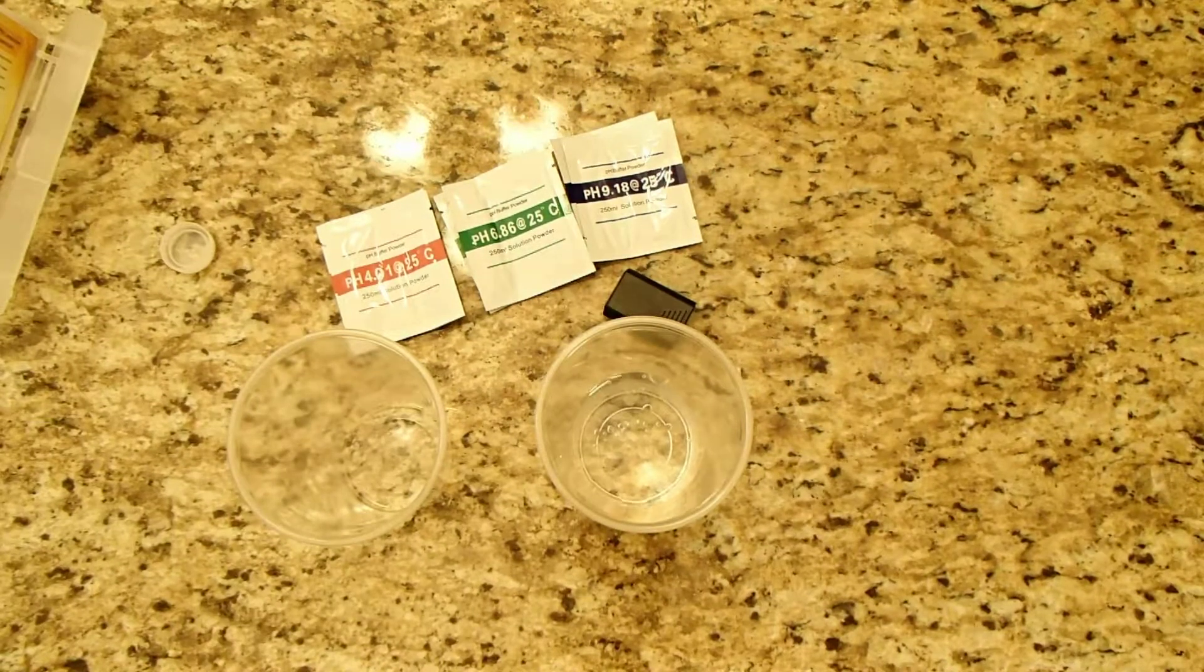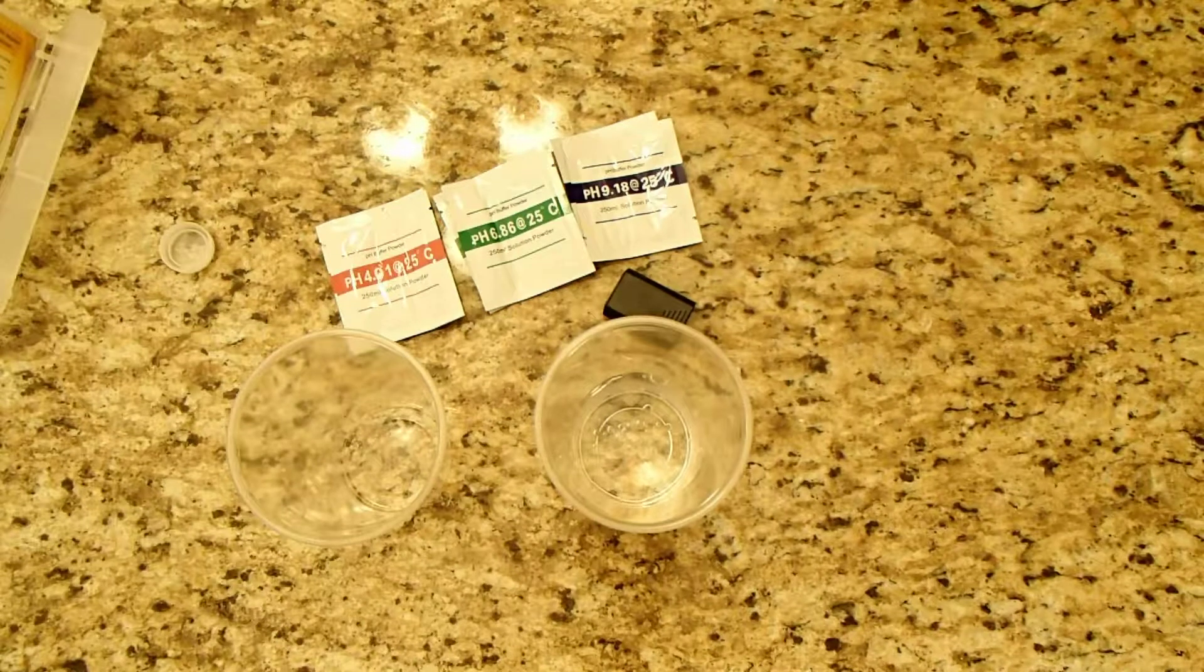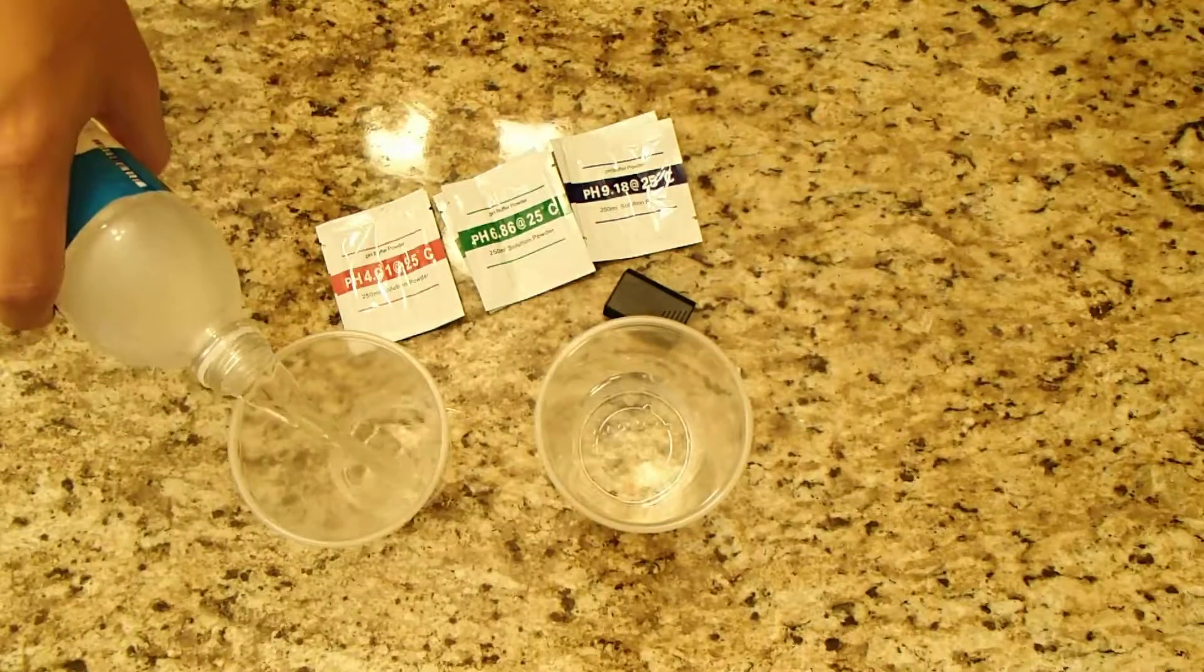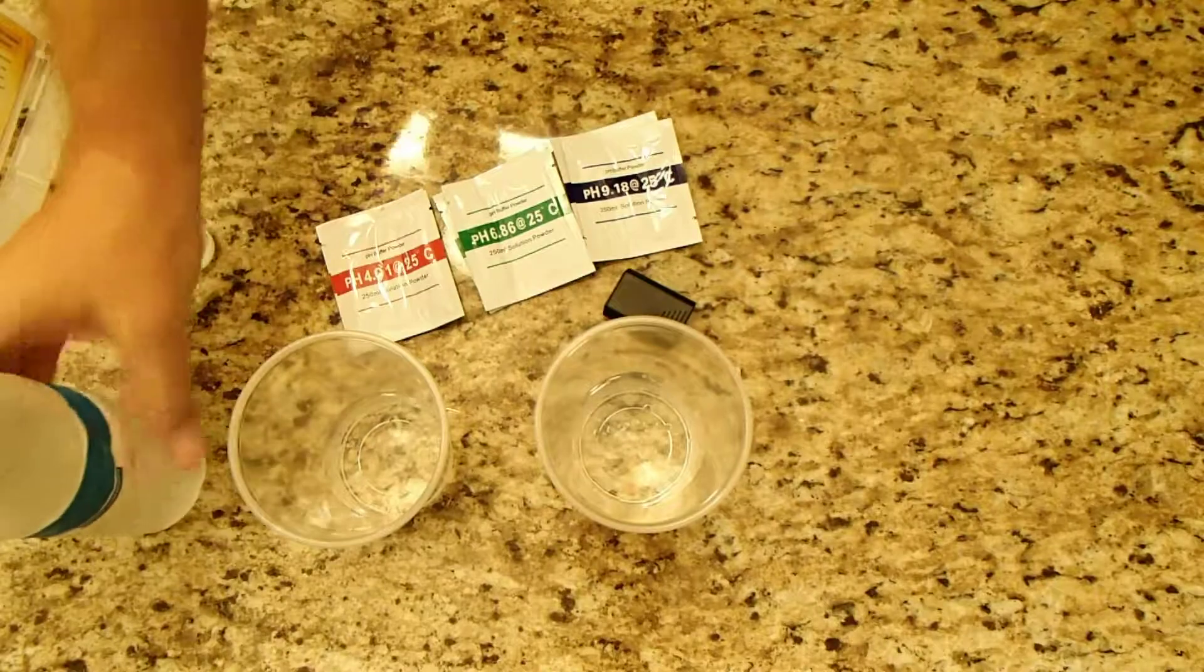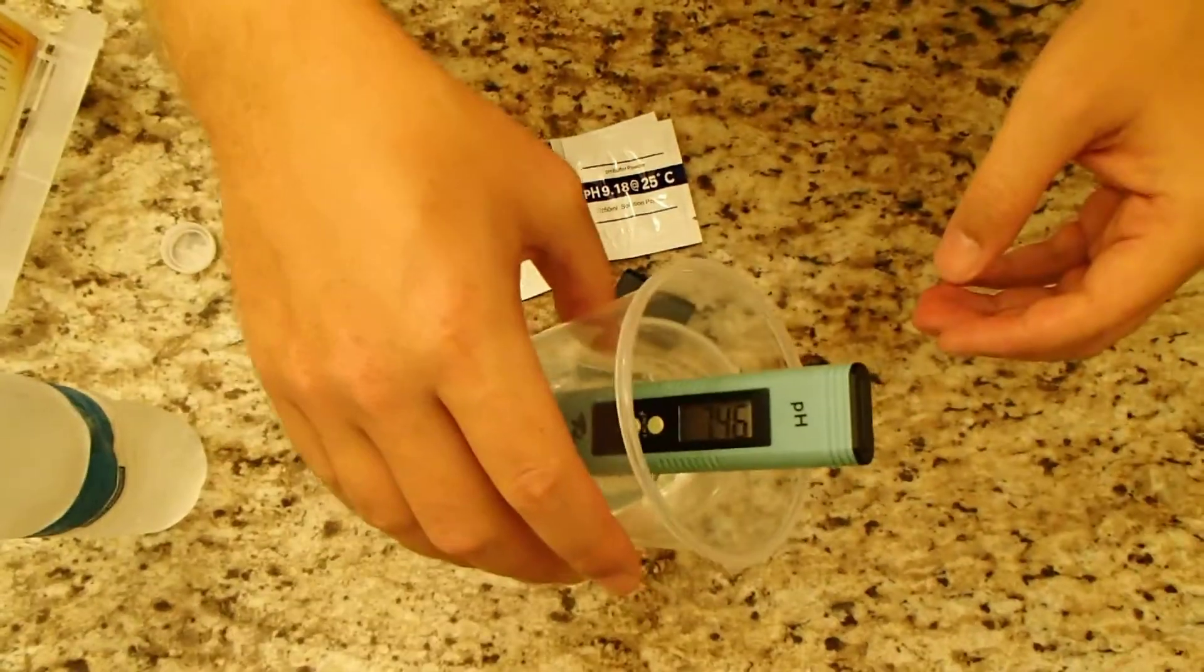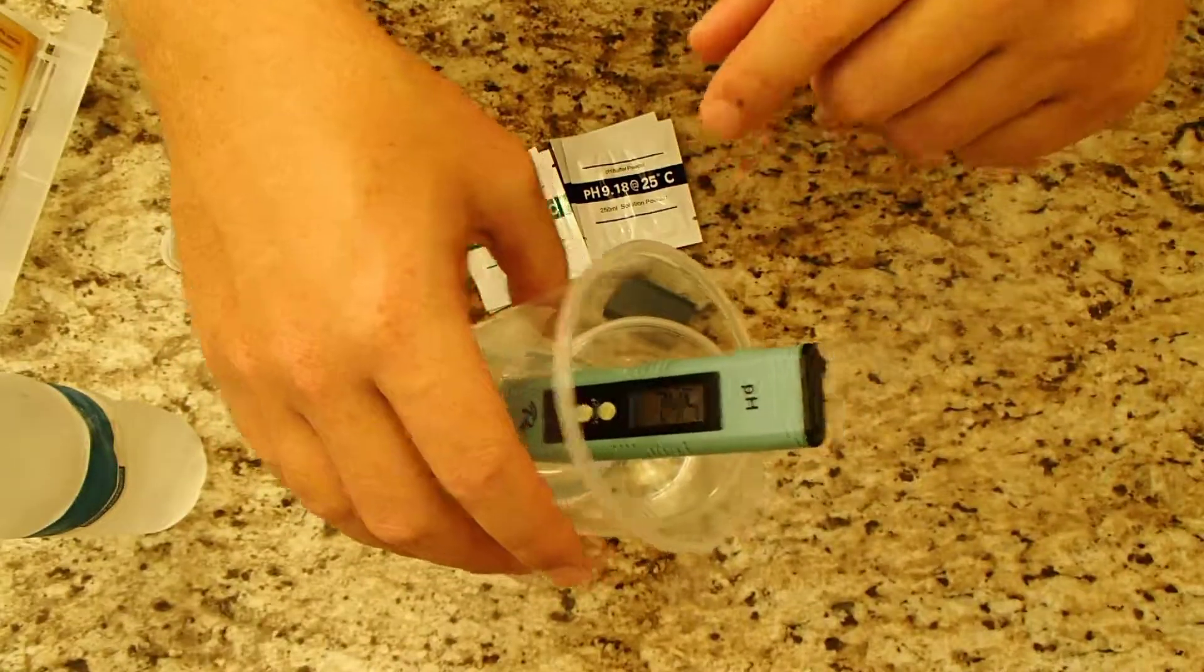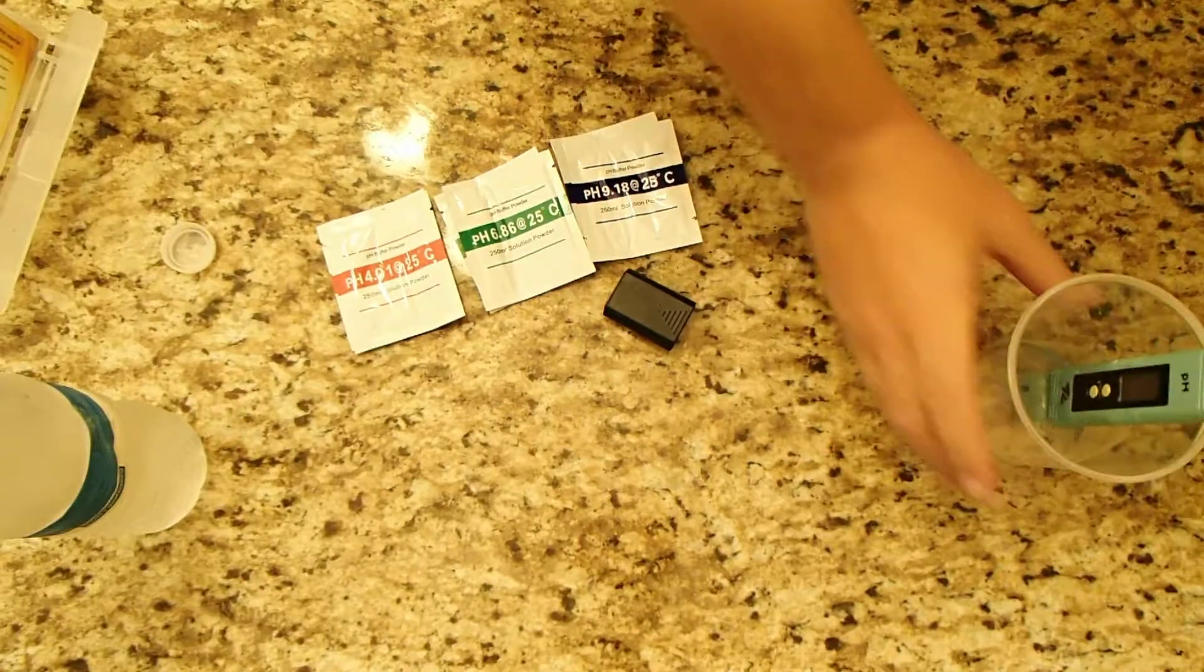We're going to rinse it off again. And let's try this bottled water and see what happens. And that one comes at, sorry, that was a 7.6. I'm reading upside down. And this one's a 7.4, so this one's, I guess, a little bit better.